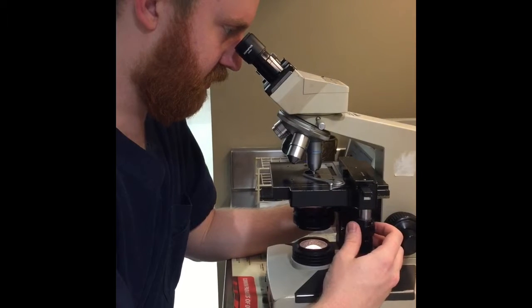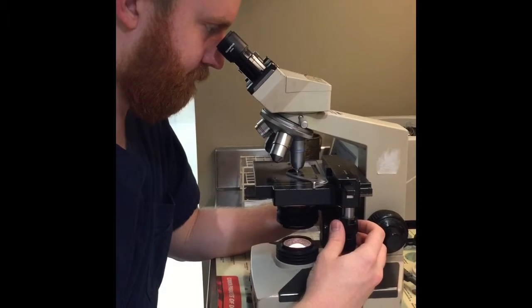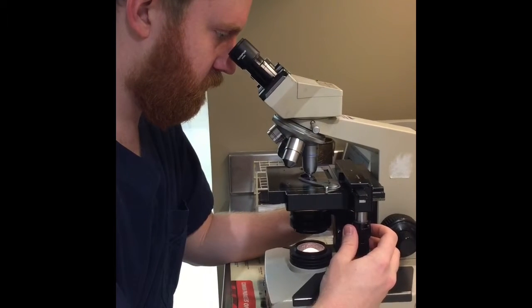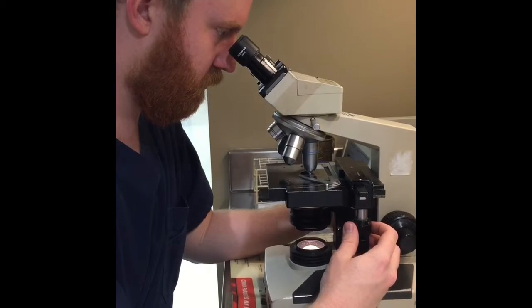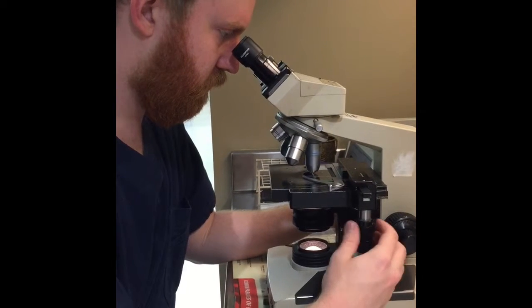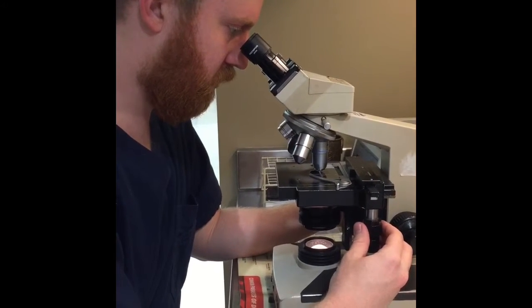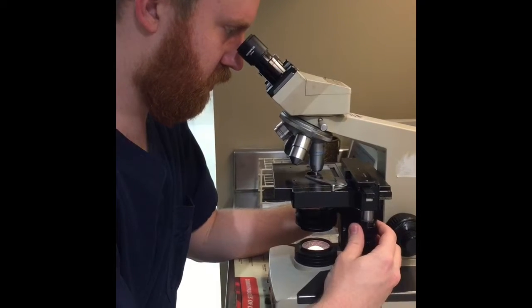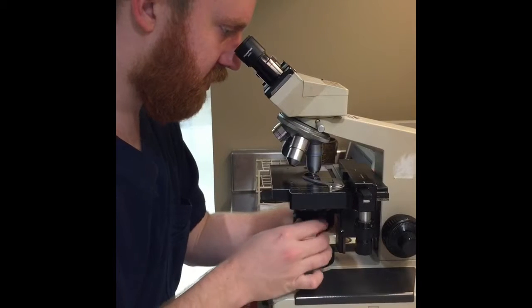Now I do actually see a red blood cell here. And this side, still seeing a lot of debris. I'm not really seeing any type of bacteria though.